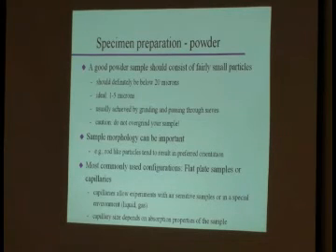Now, how do you usually mount your sample? There are two very common ways of mounting them. One is the so-called flat plate sample. Basically, you have a flat plate of a sample, and you stick it in, and like in the little drawing of Bragg's law, you bounce your X-rays off the surface of that sample. The second commonly used one is actually a capillary measurement, okay?